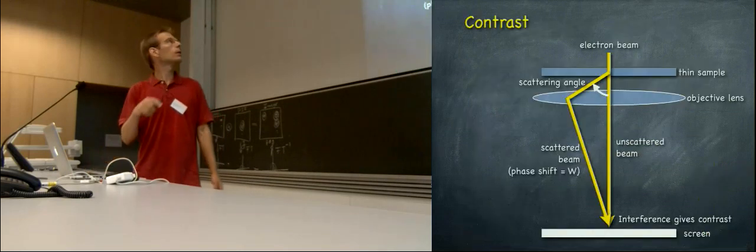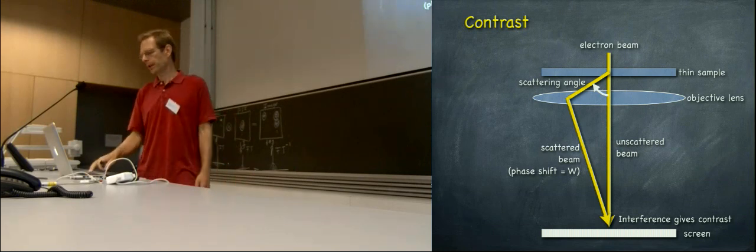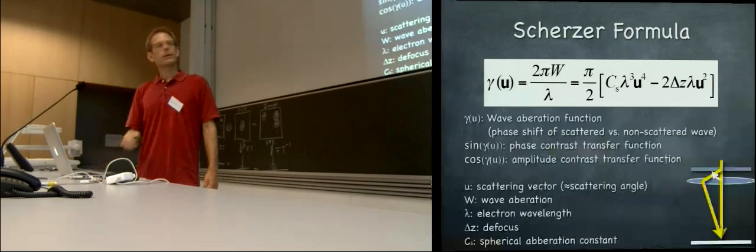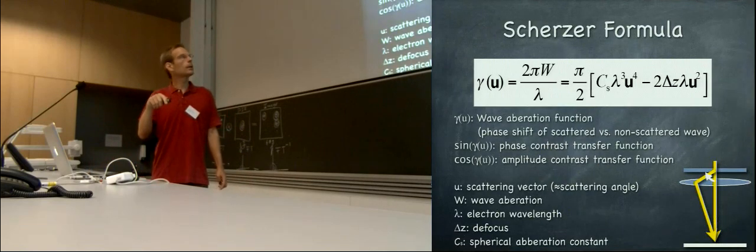According to Bragg's law, the resolution is also this angle here. Low resolution details are encoded by low angle scattered electrons, and high resolution details are encoded by high angle scattered electrons. Yeah, that's Bragg's scattering law. So we have a function that describes how the scattered electrons come too late, arrive with phase shift.